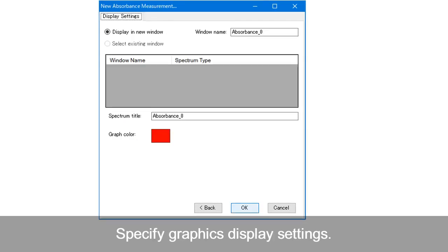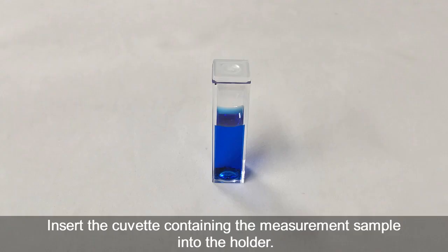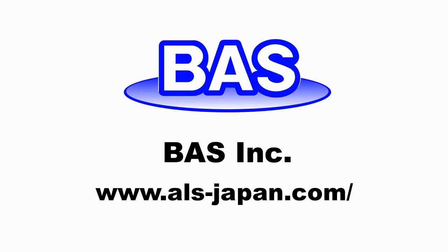In the display settings, specify the graphics display settings and click OK. Software settings are completed. Set the cuvette with the sample to be measured in the cuvette holder. The absorption spectrum is displayed on the measurement screen.